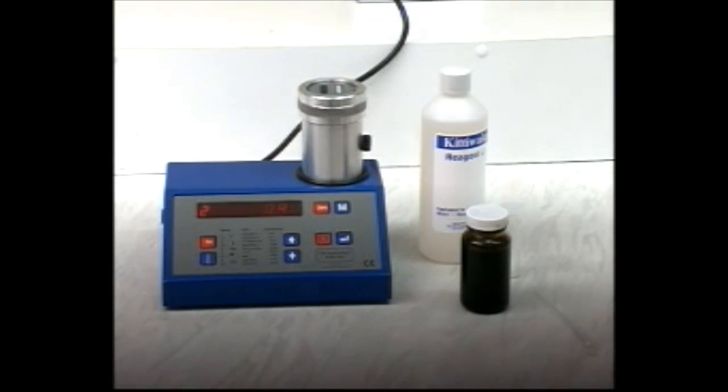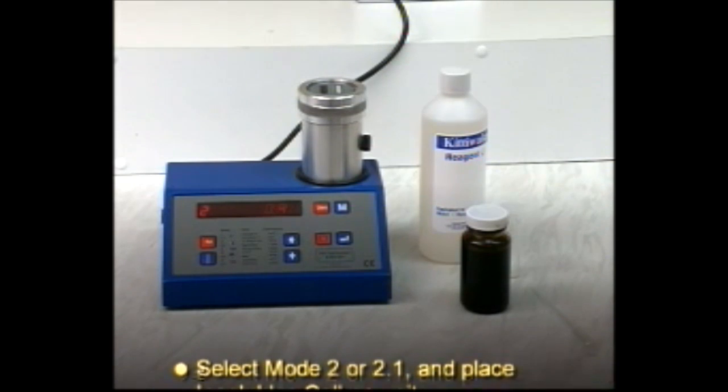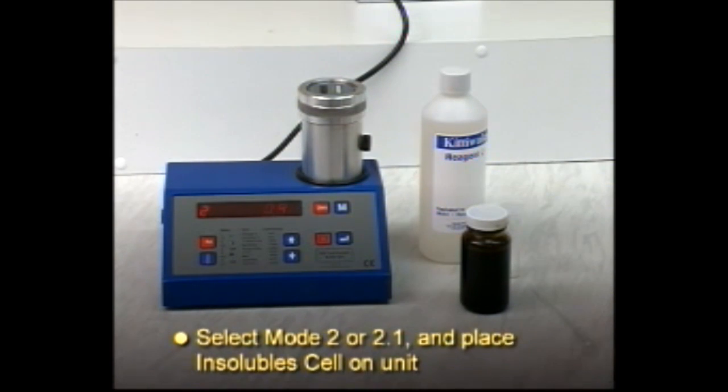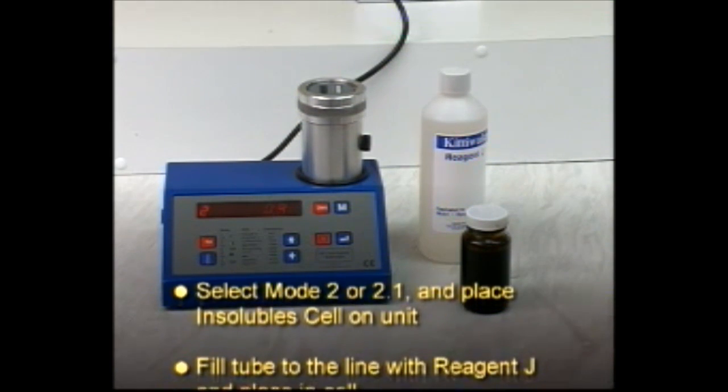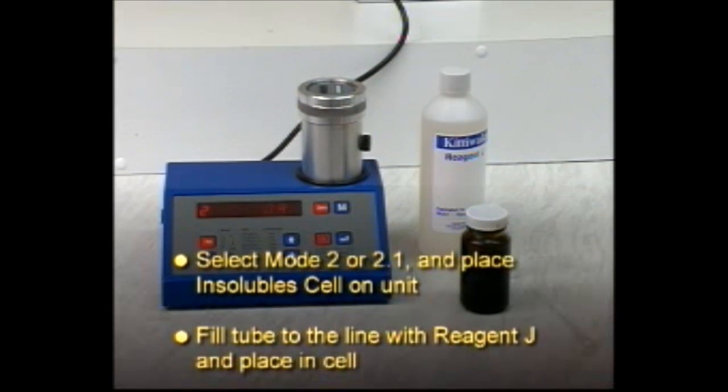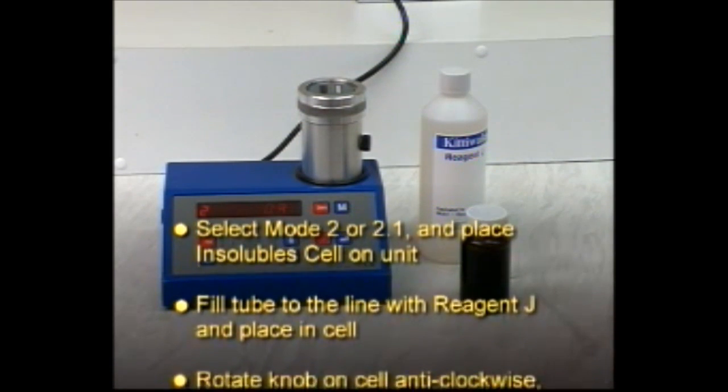To summarize, select mode 2 or 2.1. Place the insoluble cell on the unit. Fill the tube to the line with reagent J and place it in the cell.